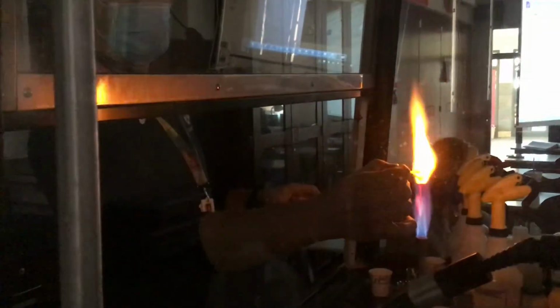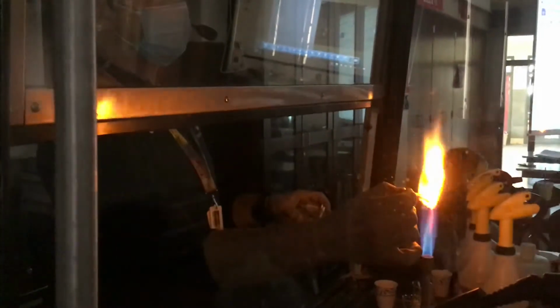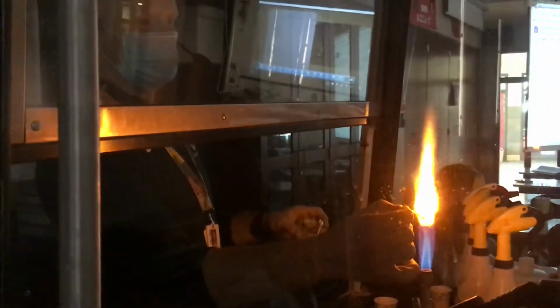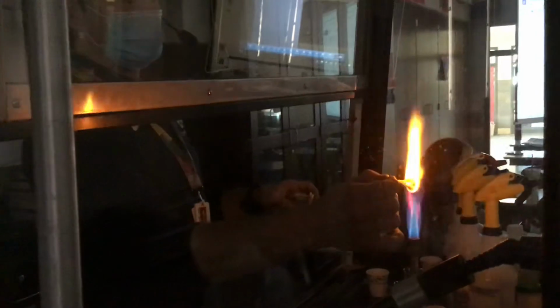The next one is sodium. I believe this is the sodium. You should be able to see this one pretty clearly. What color is the sodium? Orange. All right. Sodium is one of the most popular elements in the world that's around a lot of things because of course you have sodium in your sweat and your hands, and so that's one color that you usually see when a lot of things burn.